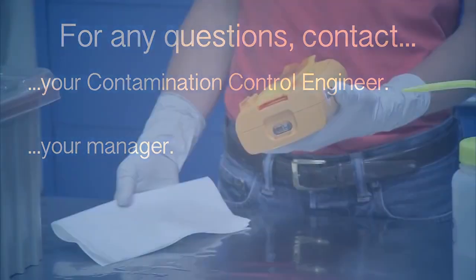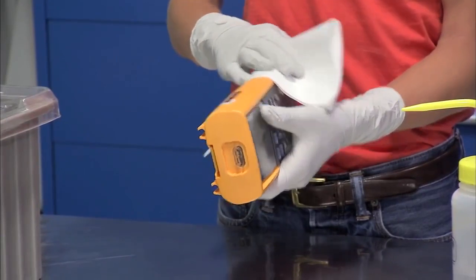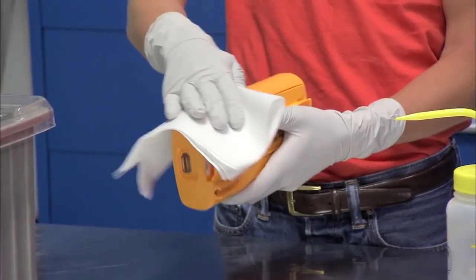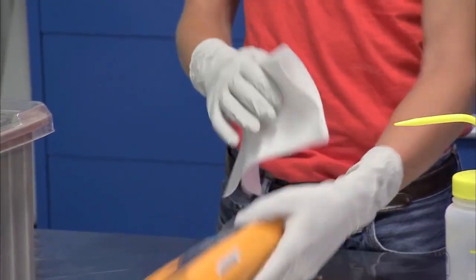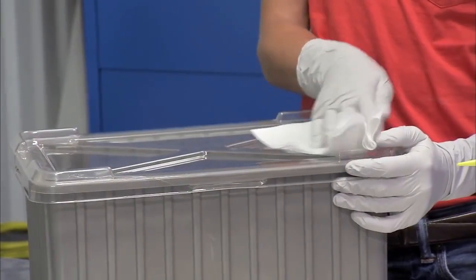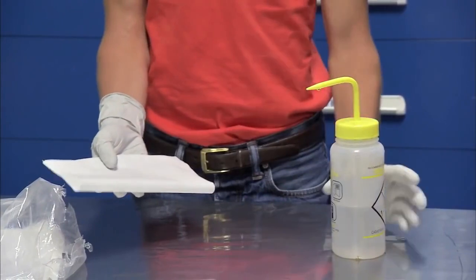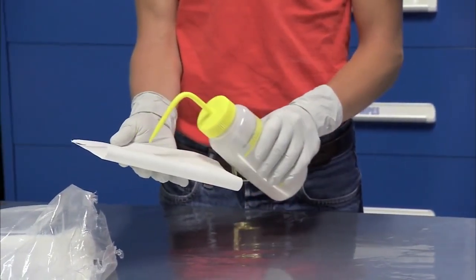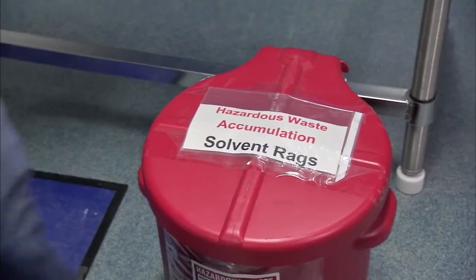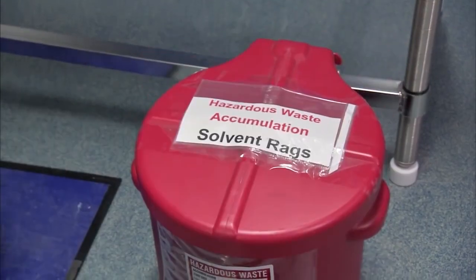Next, wipe down the outer surfaces of any tools and hardware that you plan on bringing into the cleanroom. This will reduce the amount of particles you introduce to the room. If you are carrying the items in a container, such as a tote, the outer surfaces of the tote must also be wiped down. Use the wipes and solvents provided for your cleanroom area. Wipes may be pre-moistened, or dry wipes with solvents such as isopropyl alcohol may be used. Once a wipe becomes visibly dirty, discard it in the required container and use a new wipe.